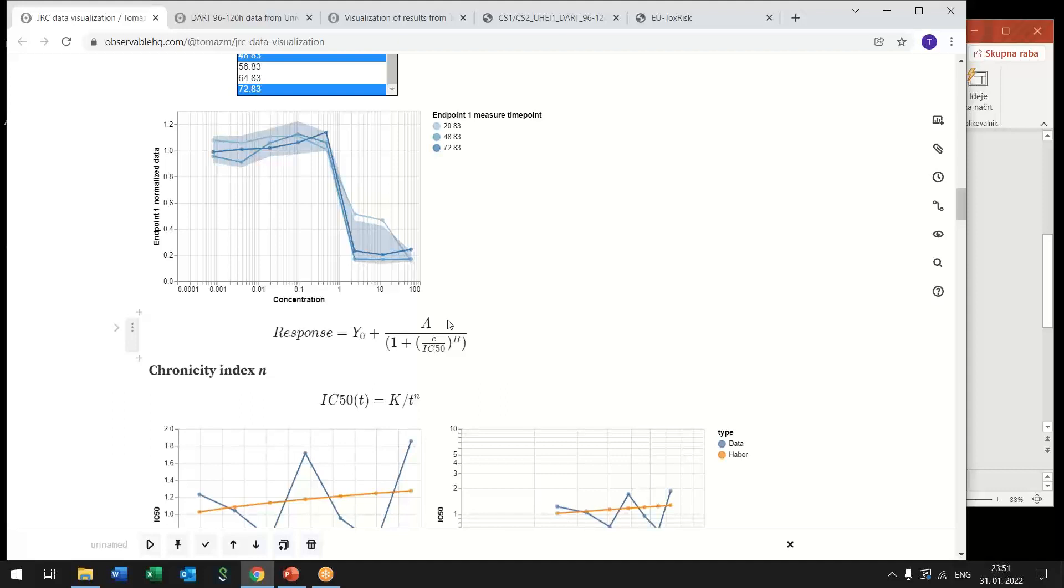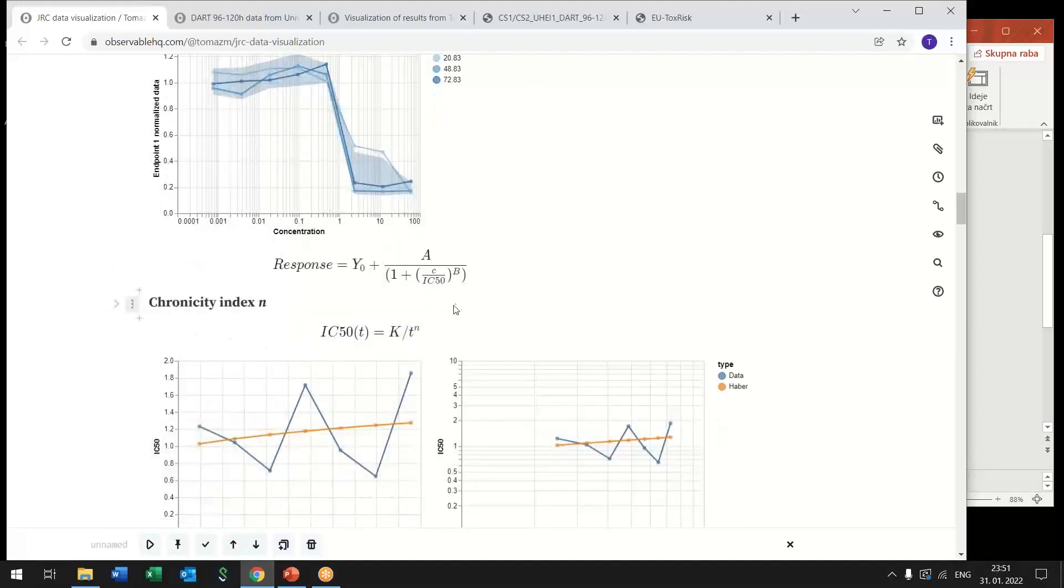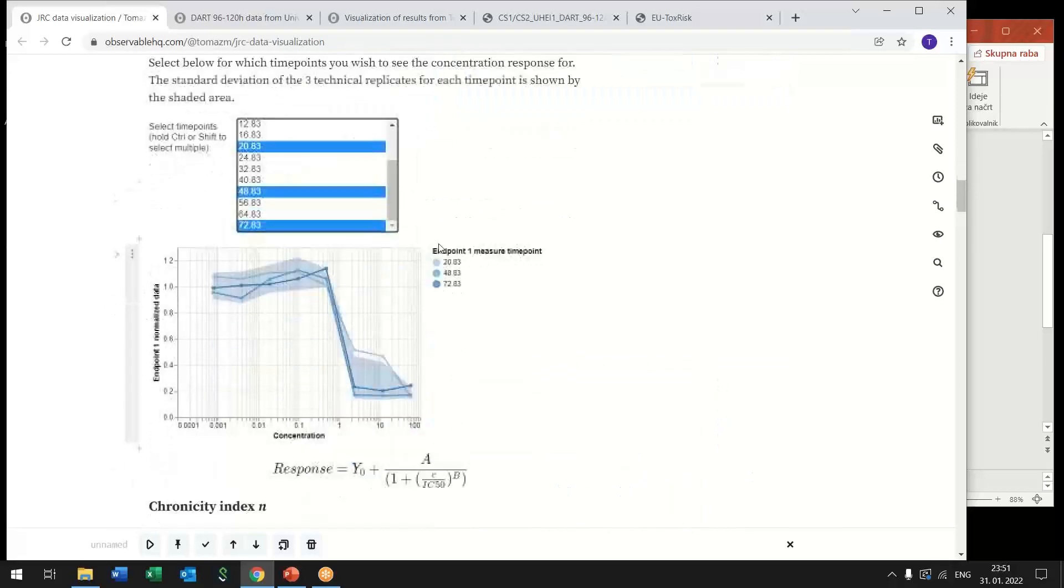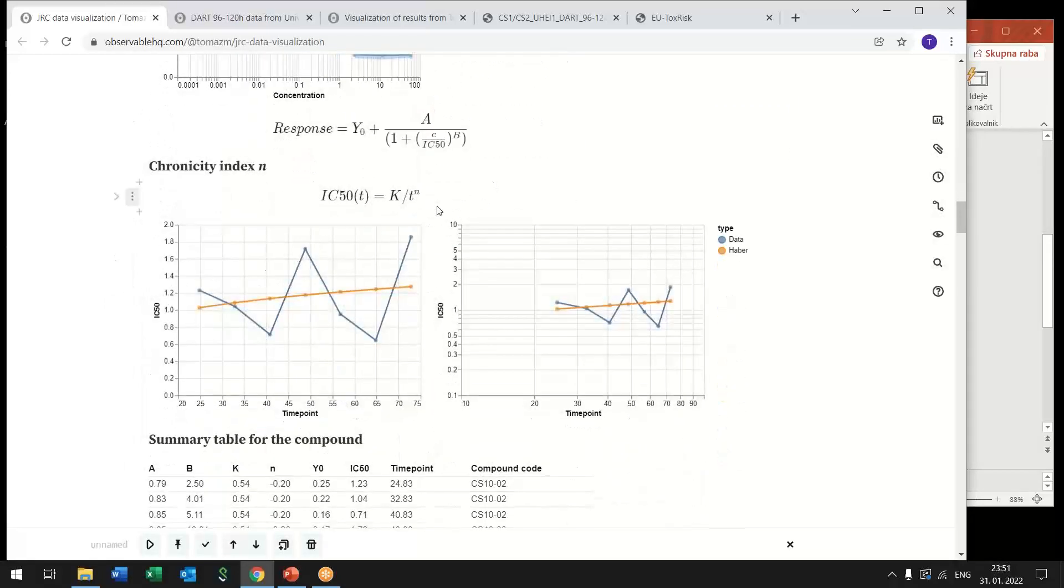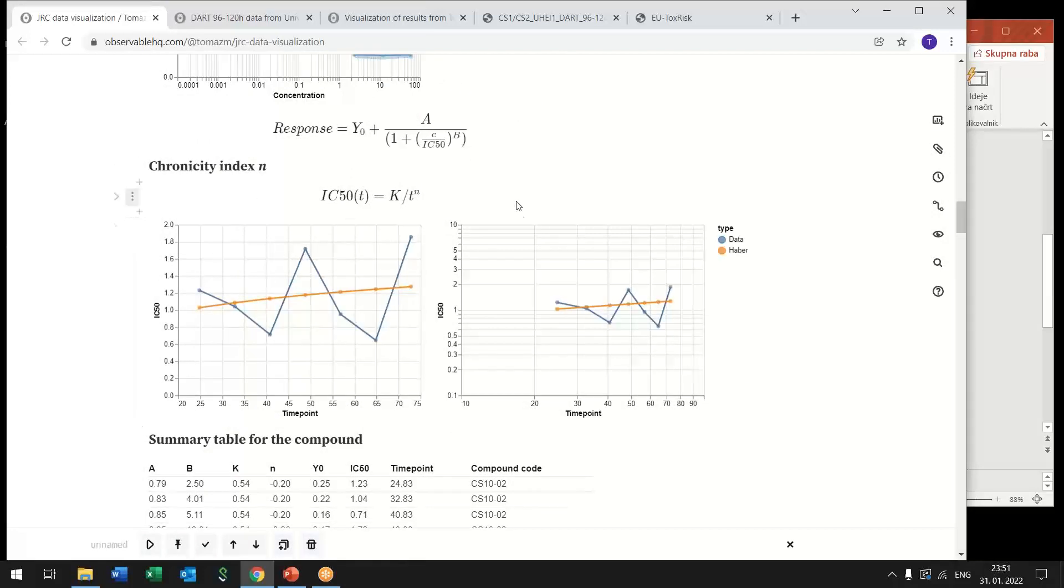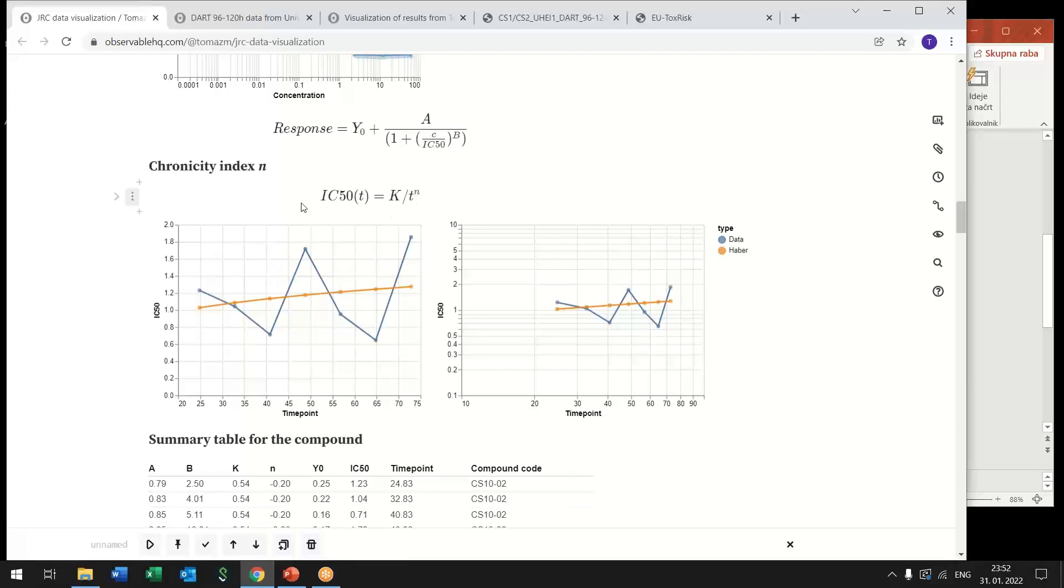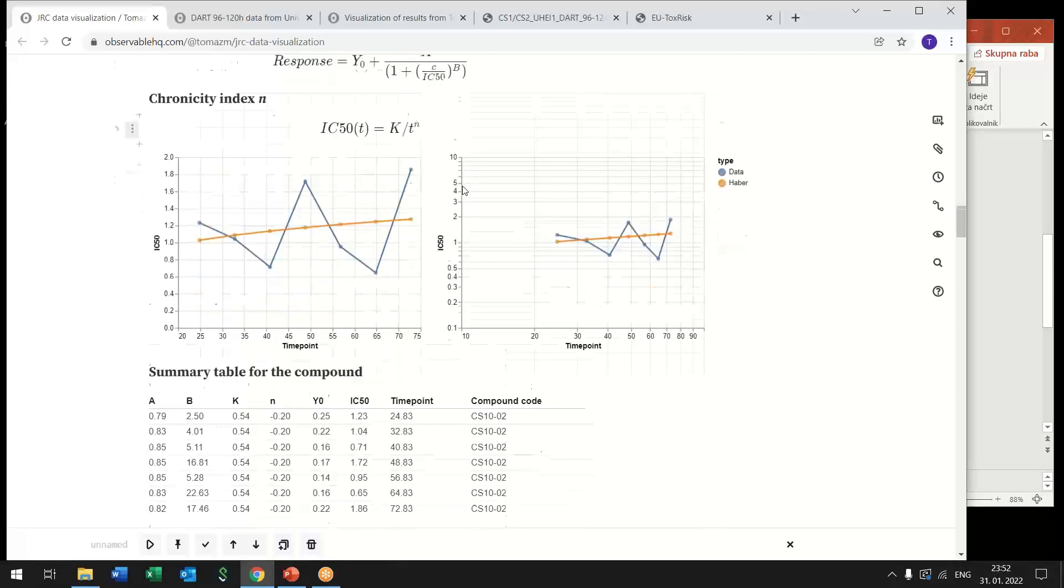This is already done offline so raw data was processed and then published also processed and summary data. So we can extract directly summary data for this compound for this experiment that we selected above and what we can see here are maybe more high level effects so we see how IC50 changes with the exposure time and here what is assumed is that IC50 is inversely proportional to the exposure time to exponent n and this n is termed chronicity index.